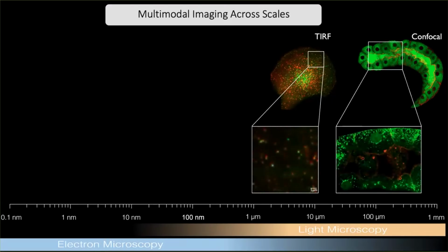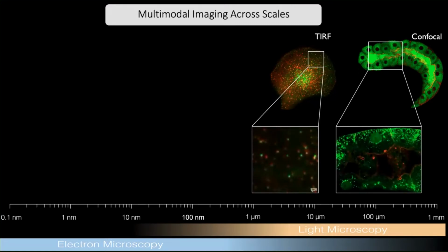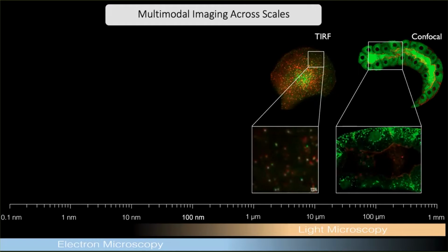And so we illuminate a very thin slice, and so we bleach less. We can image very rapidly because we are not slicing through the object. So in a way, this is a reasonable compromise. We relinquish the three-dimensionality, and what we get is sensitivity. So we can resolve these sites very nicely. We can gain very good temporal information. And the way we know that the vesicle has formed is that when it pinches off the membrane, it moves out of the field that is illuminated and disappears from the field of view.